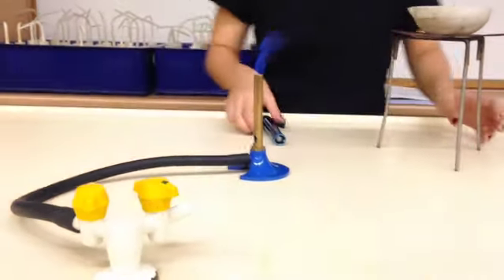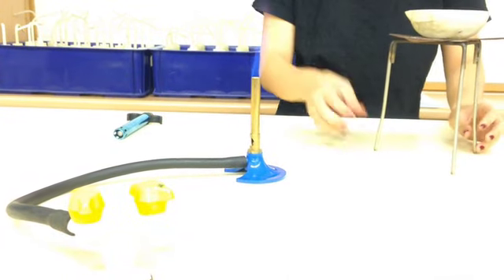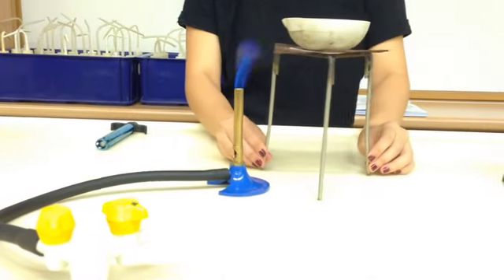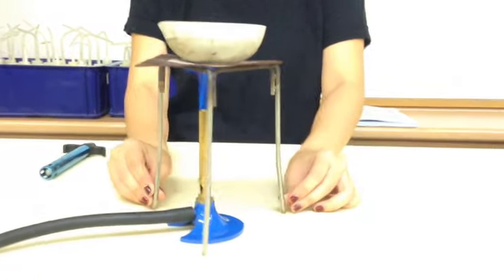You can roughly gauge how big the flame is from the sound or the size of the flame. Now with this, we're going to put the tripod stand with the evaporating dish on top and heat it.